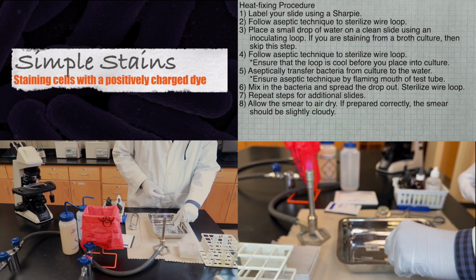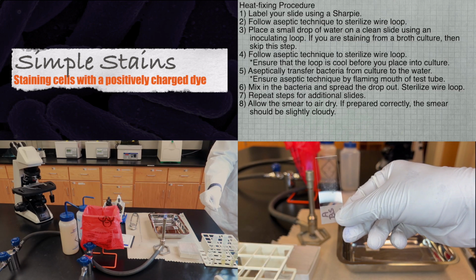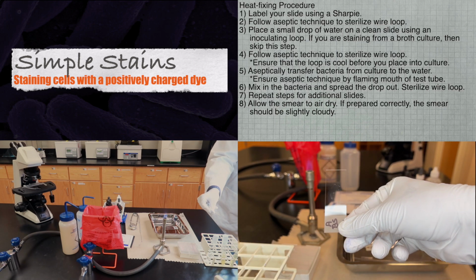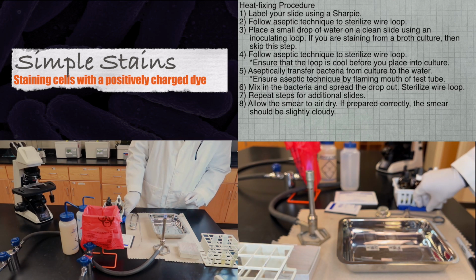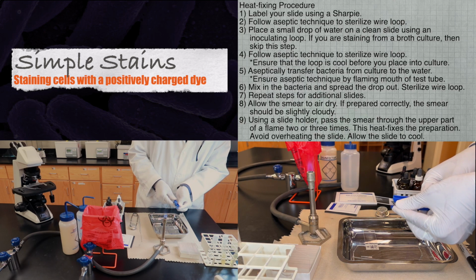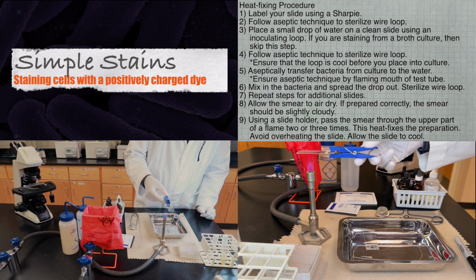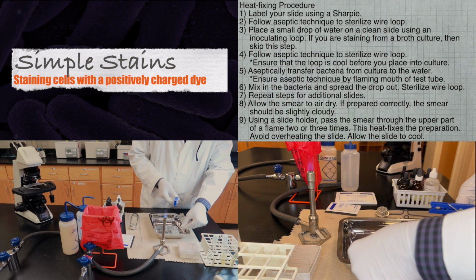Next, please allow your slide to air dry. 5 minutes later, if prepared and dried correctly, the smear should be slightly cloudy. Using a slide holder, pass the smear through the upper part of a flame 2 or 3 times. This heat fixes the preparation. Avoid overheating the slide and allow the slide to cool.